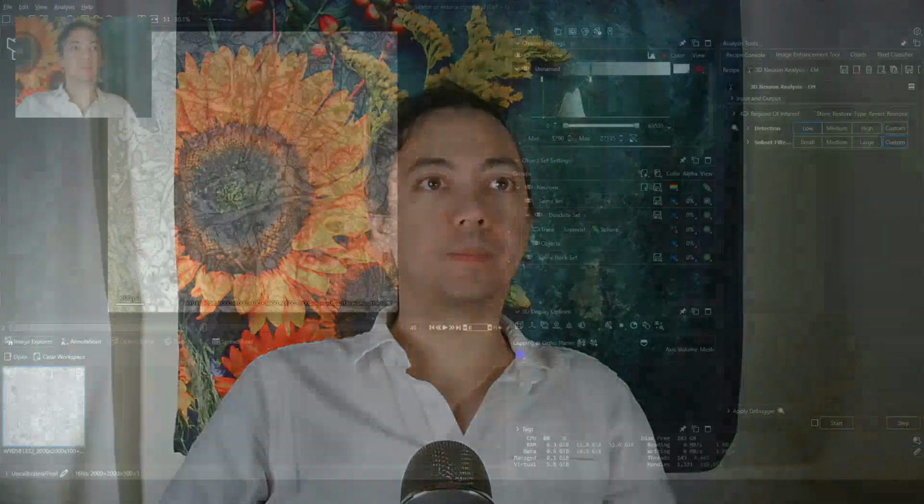Hi, my name is Sean McElroy. I'm a senior software engineer here on the Aivia team, and I'm excited to show you 2 new features today. The basic features are going to cover EM image neuron analysis and detection. The first one will be a semi-automatic approach, and the second will be a more manual approach. So let's get right into it.